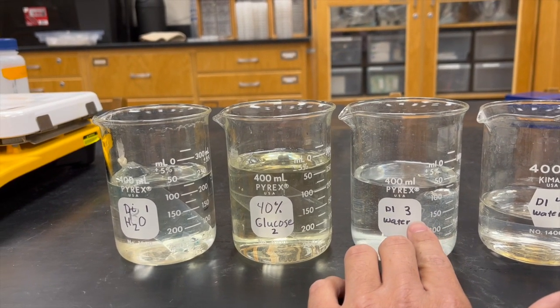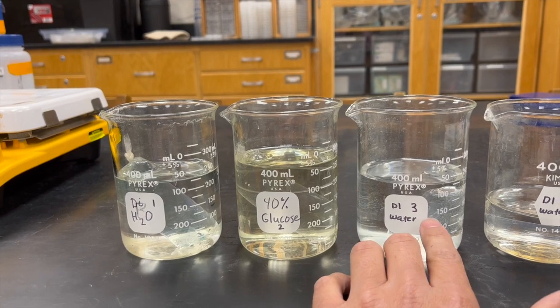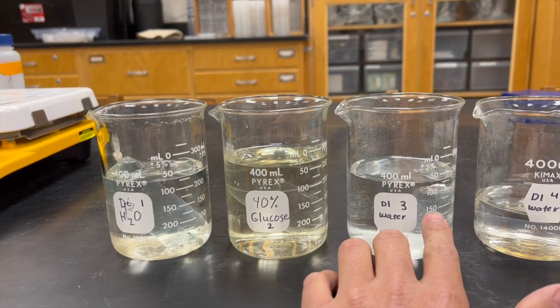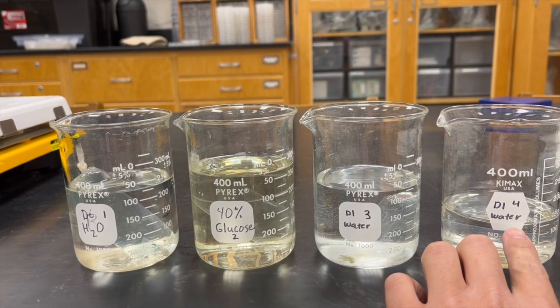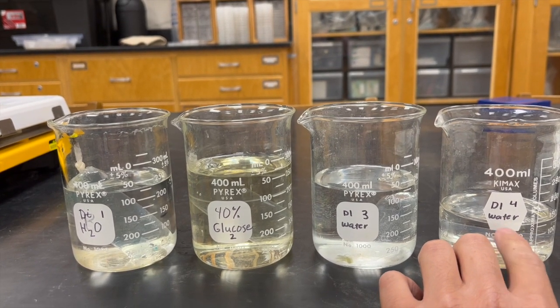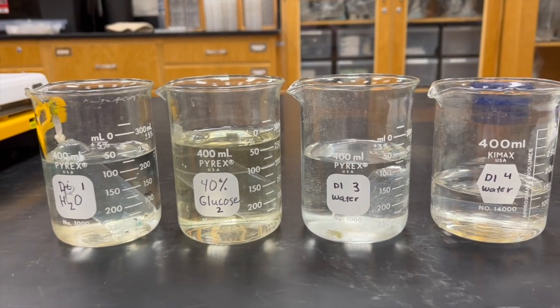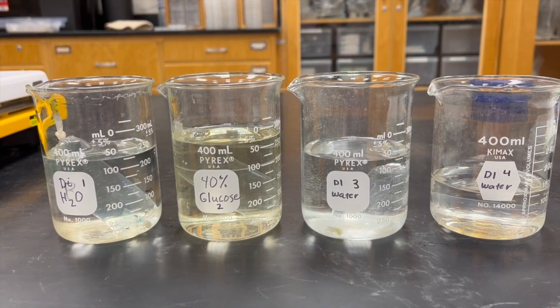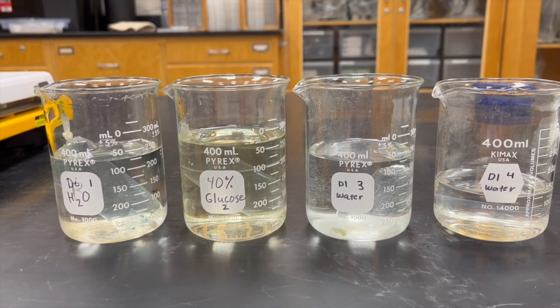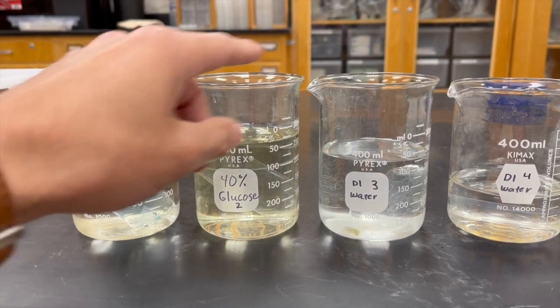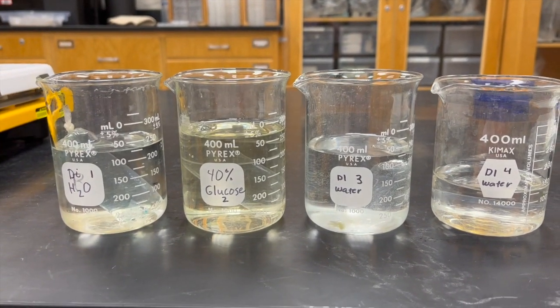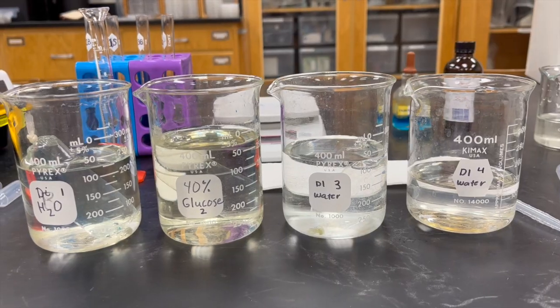For beaker three, we have a 10% salt solution within the dialysis bag. For beaker four, we have a 40% sucrose dialysis bag. You're going to let it sit there for an hour. Make sure to weigh the dialysis bag before putting it into each of their respective beakers.